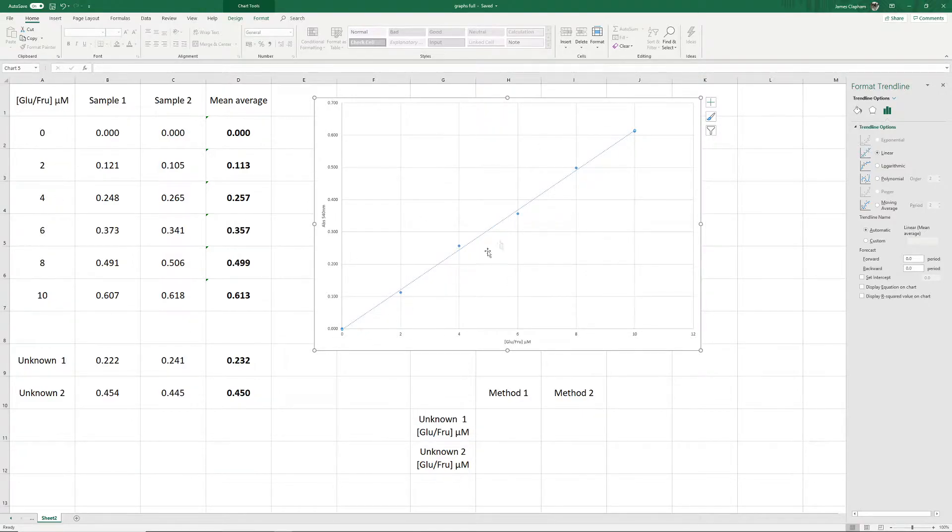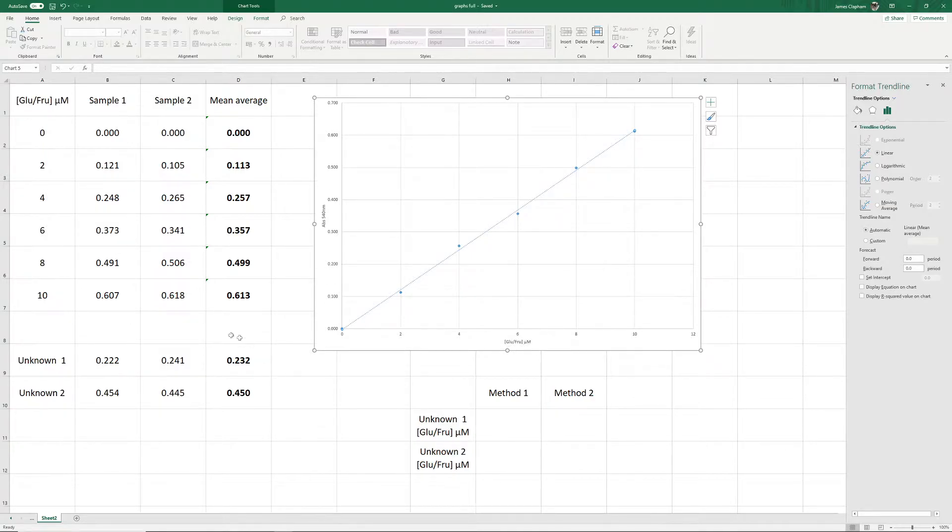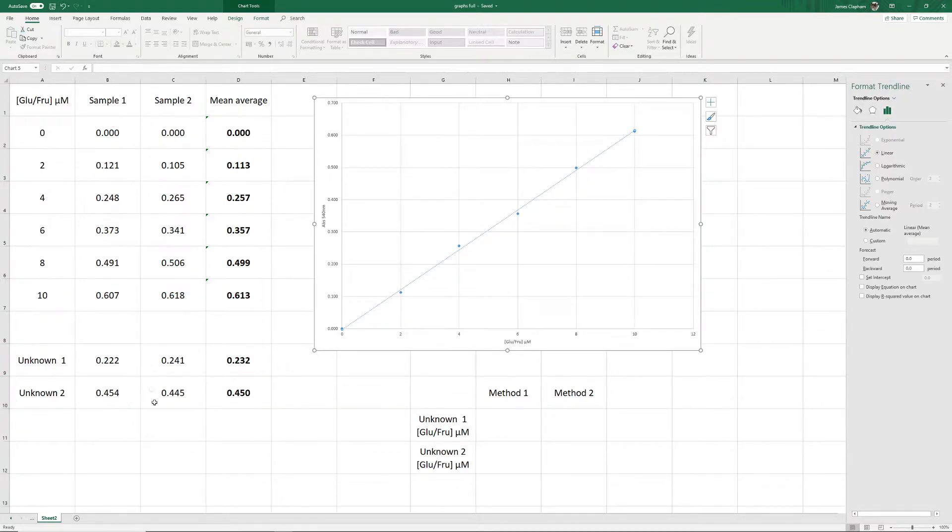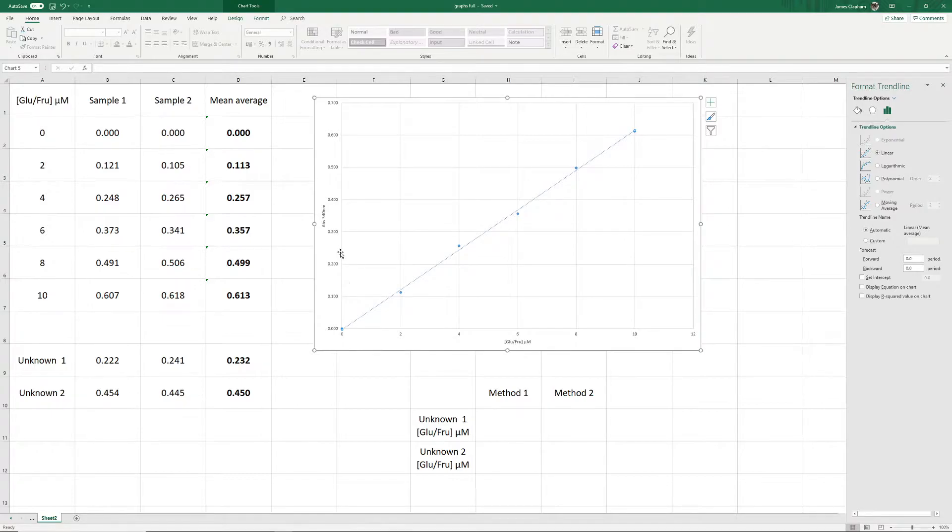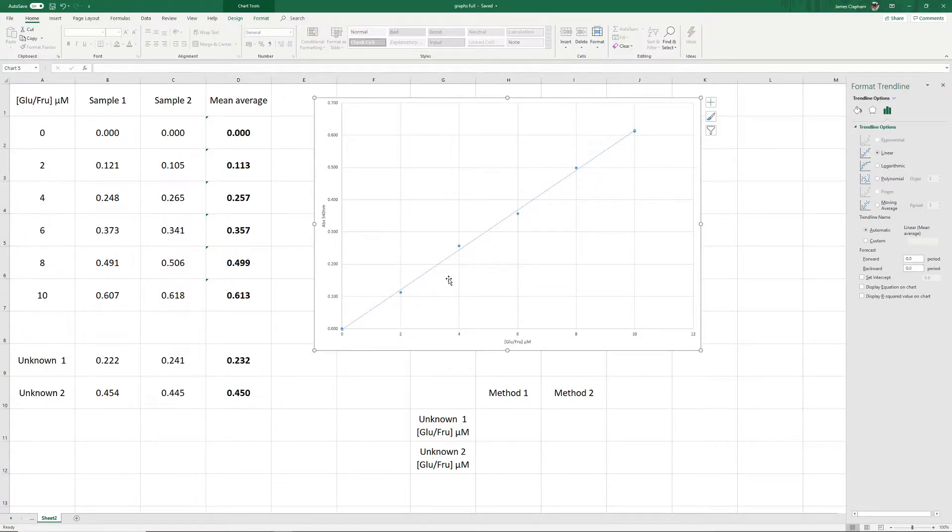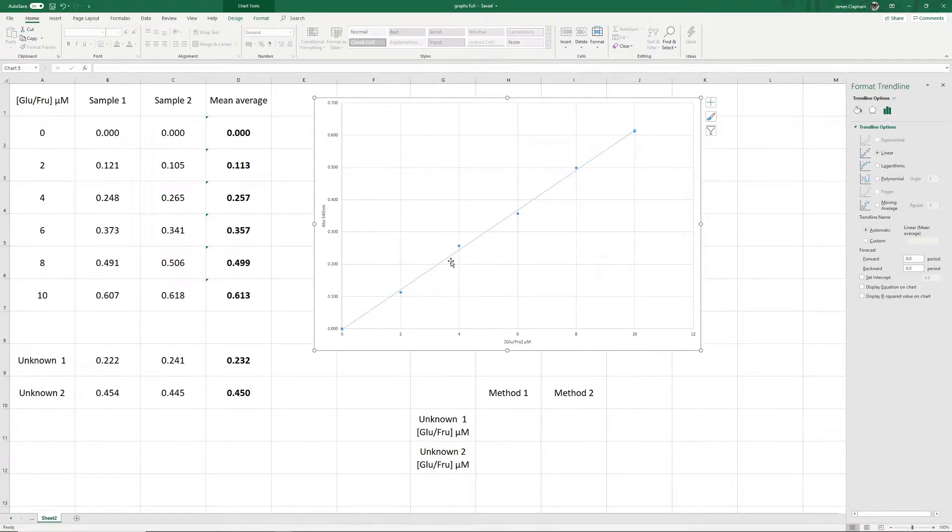We can use this to find out the concentration of glucose fructose in micromoles of our unknowns. Here we have taken our samples and run the analysis twice on them again, and taken an average. Normally what you would do, if you're doing this manually, you would take your value here, your absorbance, and go up on the y-axis to 0.232. Then you go along to your line of best fit, and then down. So it should be 3.8, 3.7, something like that.